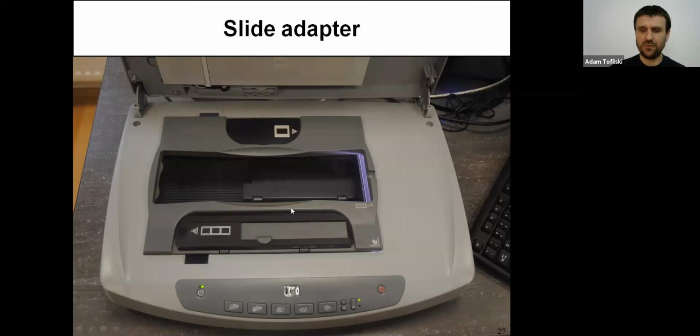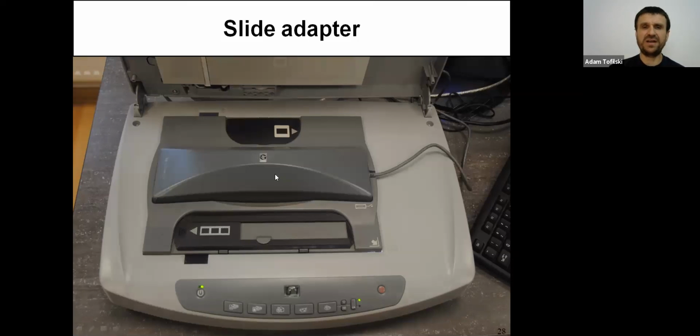Then when you prepare the wings here, you can cover them with the slide adapter, which looks like this. It's basically a light source, and this adapter provides transmitted light. Without this adapter, scanners normally use reflected light.